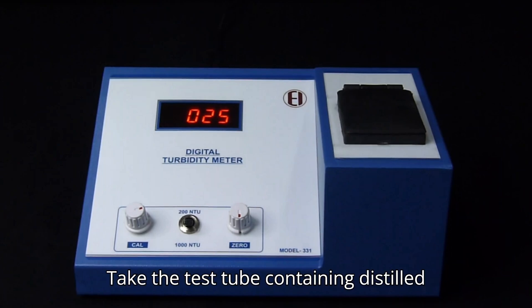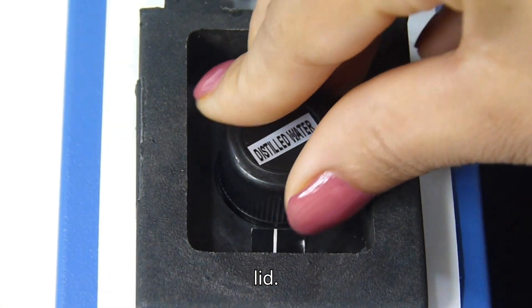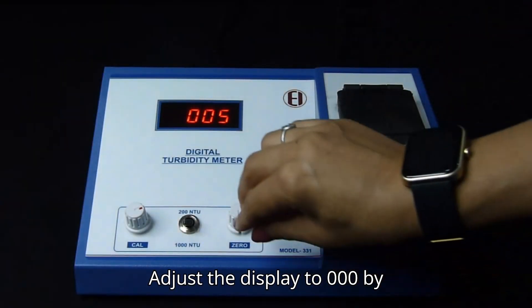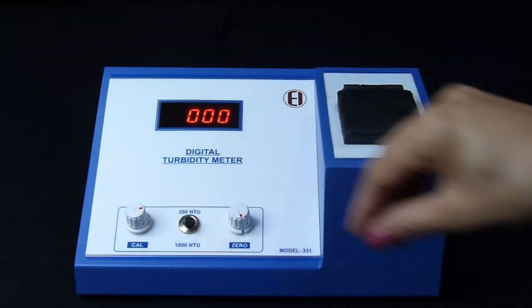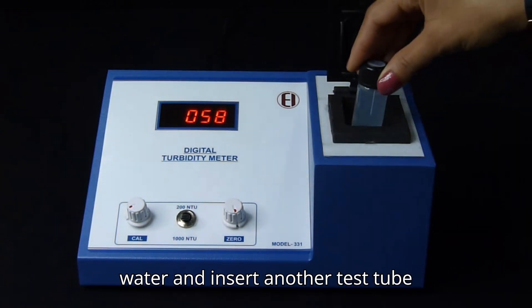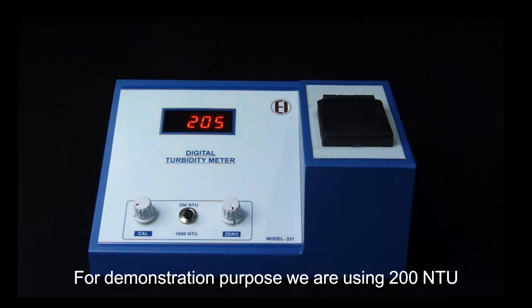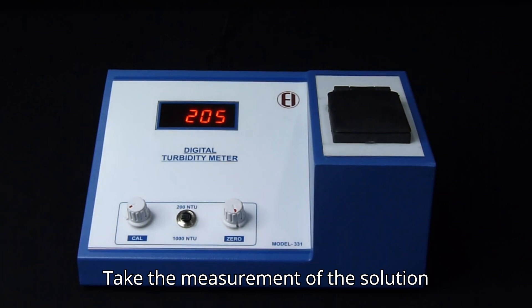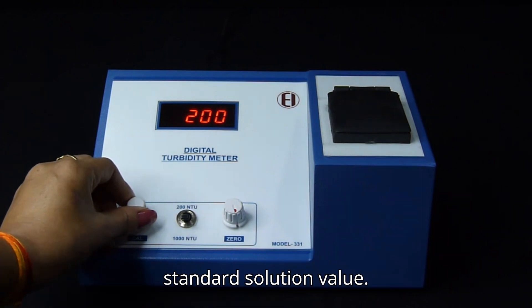Take the test tube containing distilled water or blank solution, place it in the test tube holder, and close the lid. Adjust the display to 0.00 by adjusting the Set 0 knob. Remove the test tube containing distilled water and insert another test tube containing standard solution. For demonstration purposes, we are using a 200 NTU solution as a standard. Take the measurement of the solution suspension and adjust the calibrate knob so that the display reads the selected standard solution value.